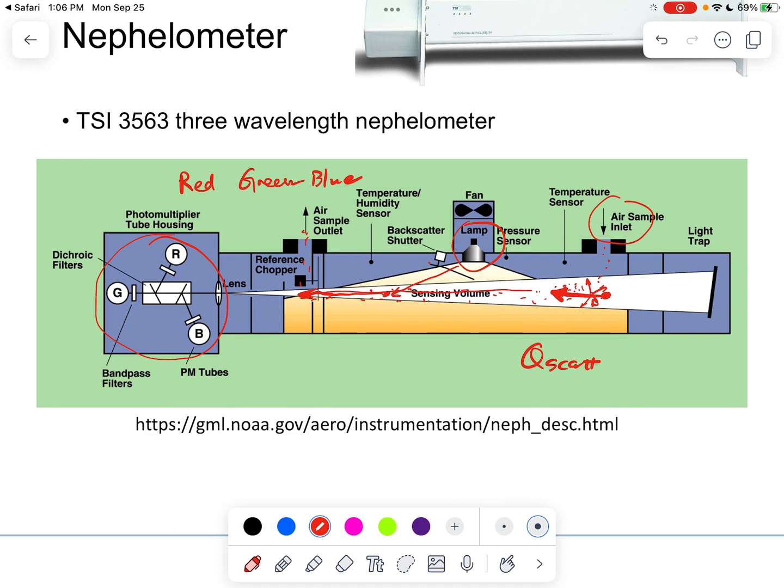of the aerosols. And for this instrument, it also has a shutter here, which considers the backscatter only. So the shutter here basically will block half of the radiation here, or this illumination here. So basically, when particles go through the system, there will be no particles scattering light in the forward direction. So there's only particles scattering light in the backward direction.